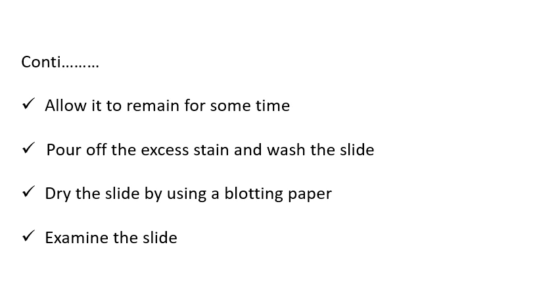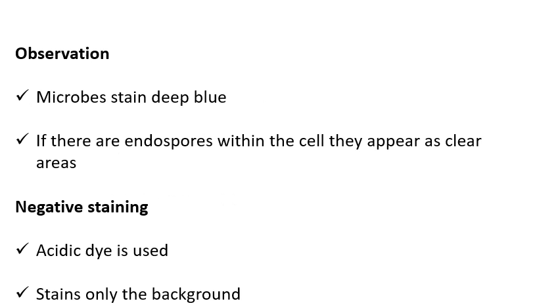After time maintenance, you have to remove the stain and wash it under tap water. After washing, you must air dry the slide, using blotting paper. Then examine the slide under the microscope.